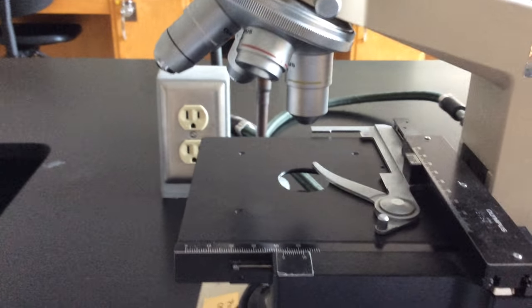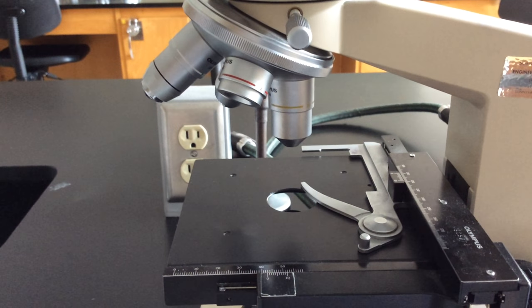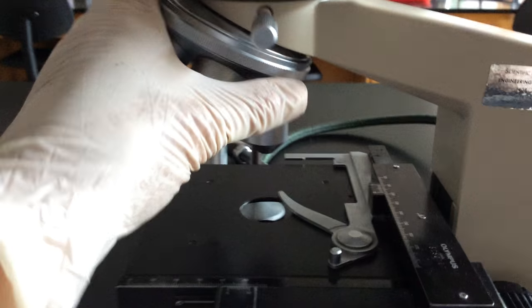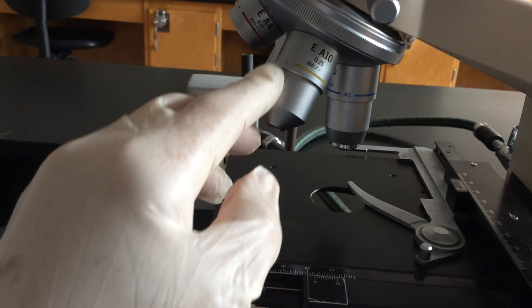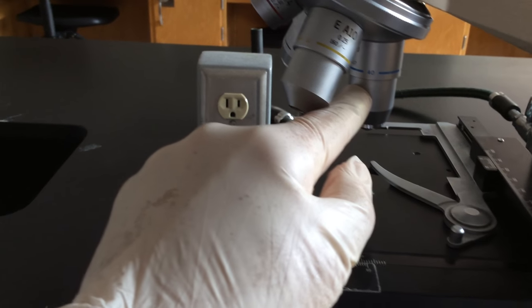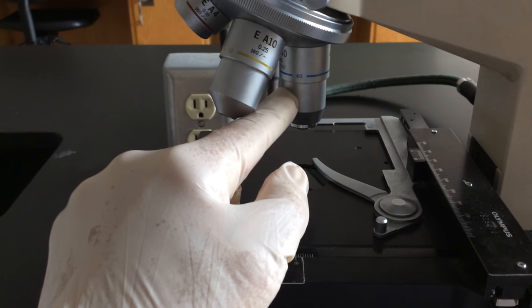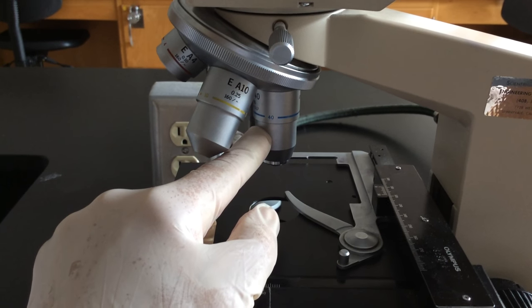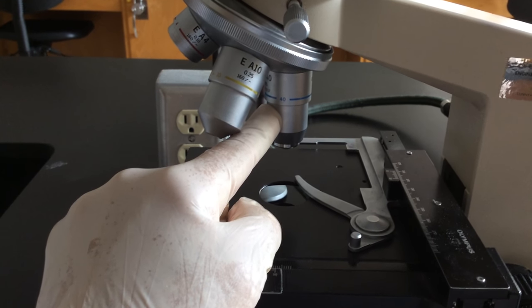The next most powerful objective lens is the low power lens, or 10x lens. We want to remember that we can use the coarse focus adjustment only with the scanning and the low power lens. Now we're going to rotate to our third objective lens. You can see that as magnifying power increases, the length of the lens gets longer and longer. This is the 40x lens, the so-called high dry lens. Do you know what total magnification would be if we're using the high dry lens? It would be 40 times 10, so total magnification would be 400. And we want to remember that we can only use the fine focus adjustment knob with our 40x lens.